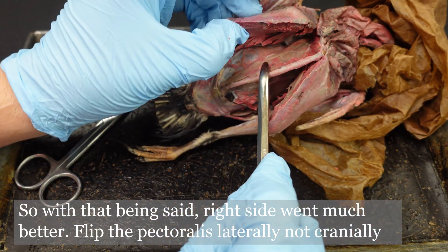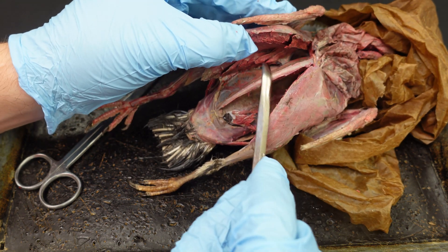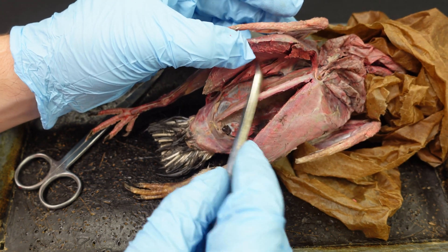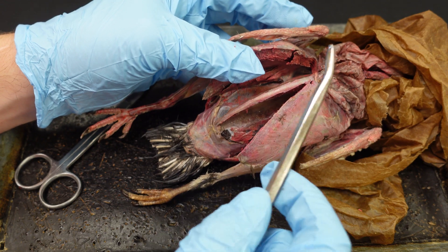This wing-direction technique is probably the one we're going to go with. If you're doing a pigeon dissection, just continue the cut up the furcula and push that pectoralis off to the side.